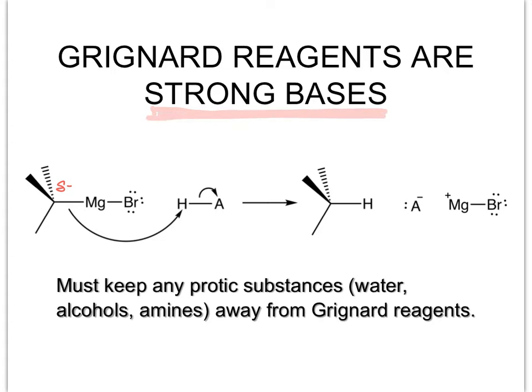And so if there's something in there that's in any way acidic, that will become protonated. And instead of a useful Grignard, a hydrogen will replace our polar bond and create something that is relatively non-reactive. Once we put a hydrogen on these kinds of carbons, those hydrogen-carbon bonds are not reactive.